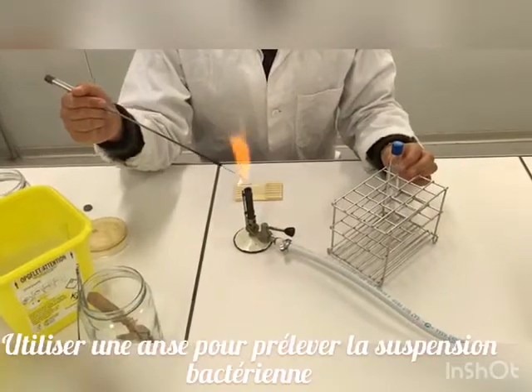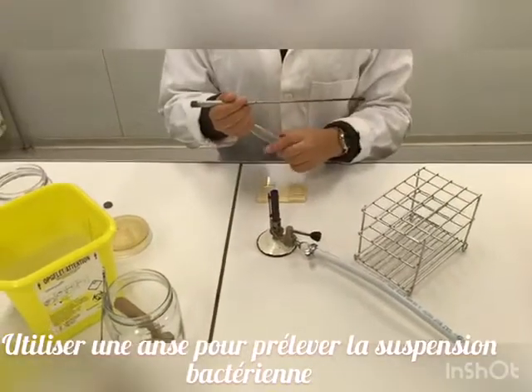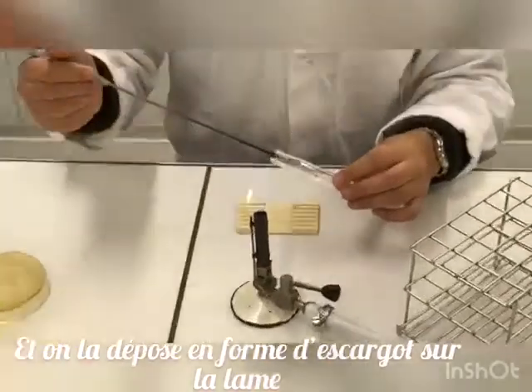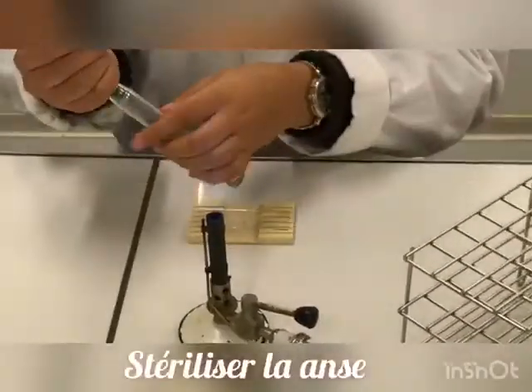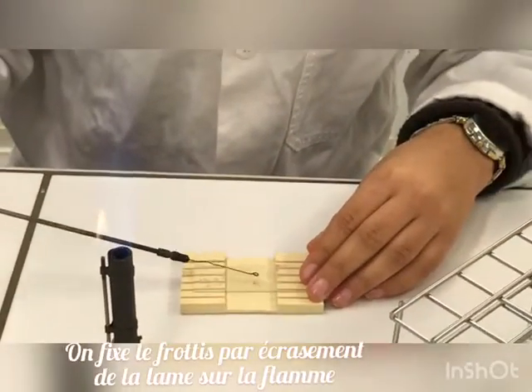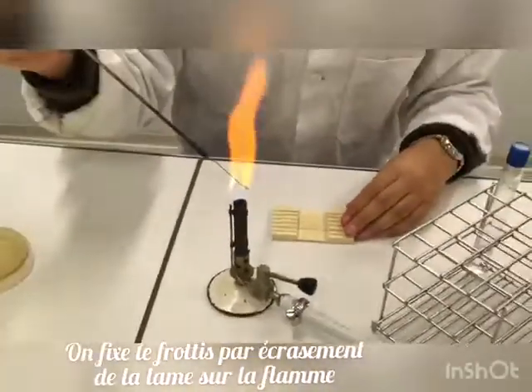Now, to show how we do a bacterial smear: using the wire, we take a part of the bacterial suspension and make a smear on the slide. We sterilize the wire, and when the smear is dry, we fix it by passing it over the flame.